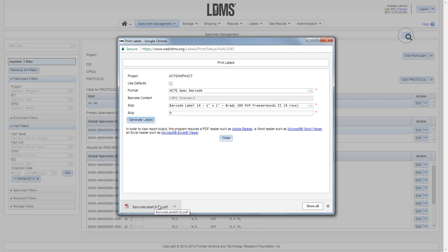Please be aware of your browser settings so that you know where that PDF is being downloaded so you can access it.